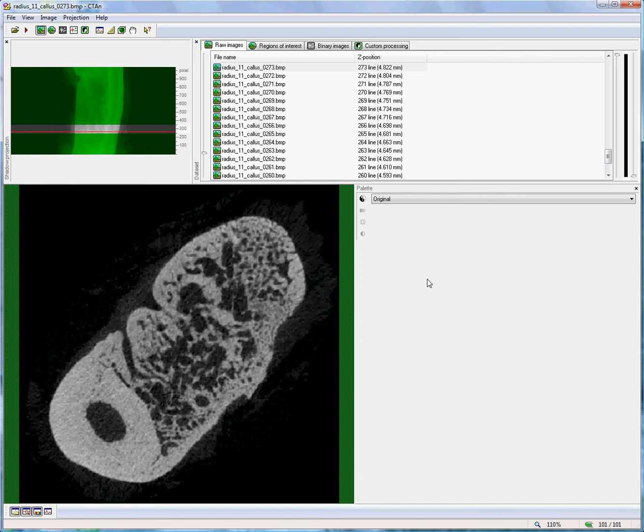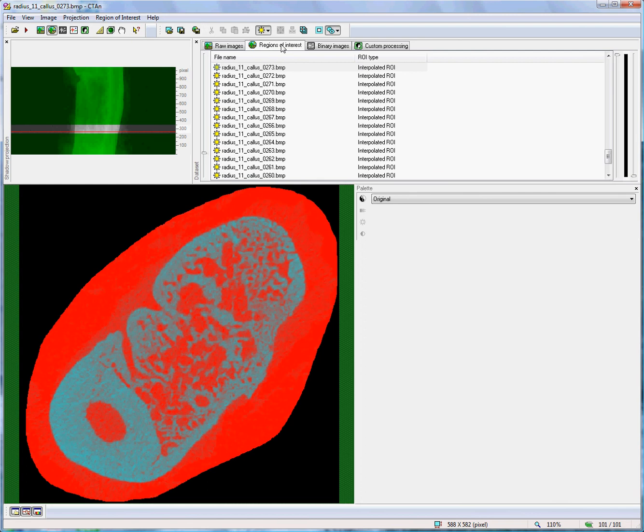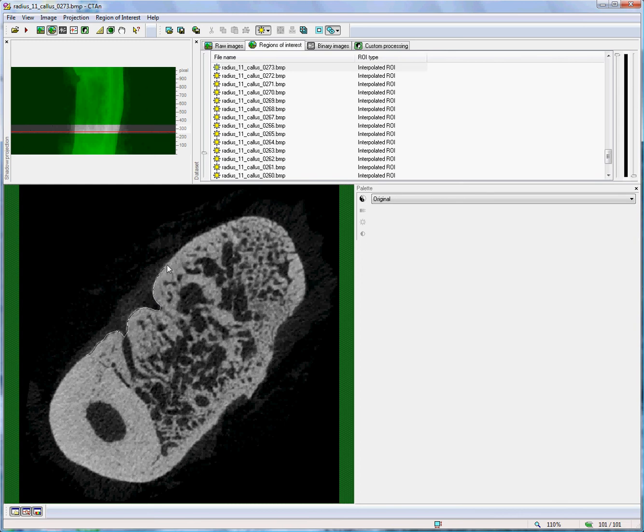In this case we are looking at a fracture callus from a bone orthopaedic experiment, and the objective is to make the region of interest wrap around the boundary of the bone. Now to do this manually, for example in the region of interest page of CT Analyzer, would be very tedious and would not be particularly accurate. It would take a very long time. So there exists an automatic alternative to this.